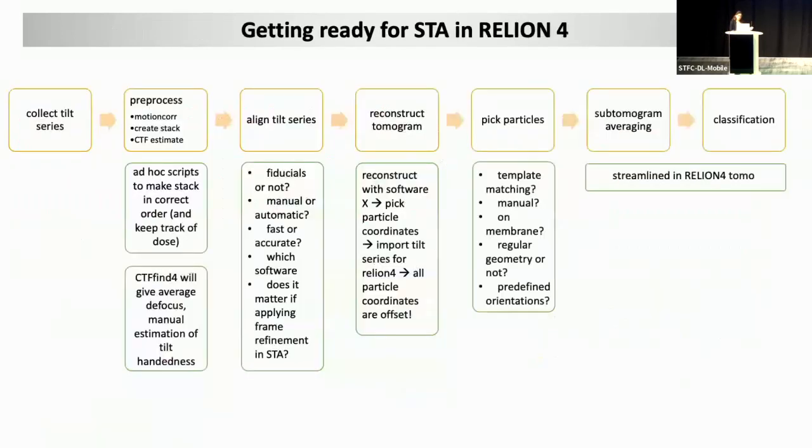What I want to do is focus on the pipeline that we have been using in the past and how we improved it recently. This summarizes the main steps that I think most of us doing cryotomography and subtomogram averaging go through. Of course, we need to start with collecting the data, and I don't have anything to say there apart from the fact that all the data that I'm going to show you today was collected at EMBL through the iNext program. So a big thank you to Wim and his team for really excellent data.